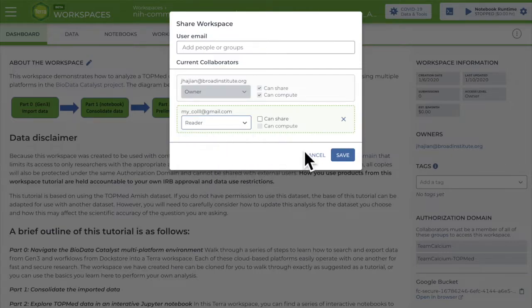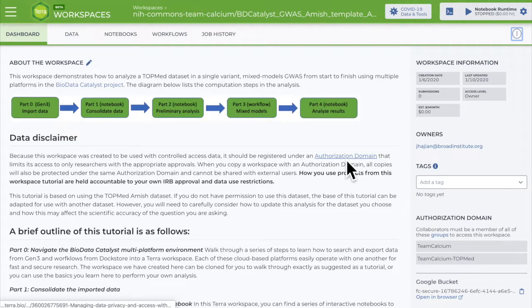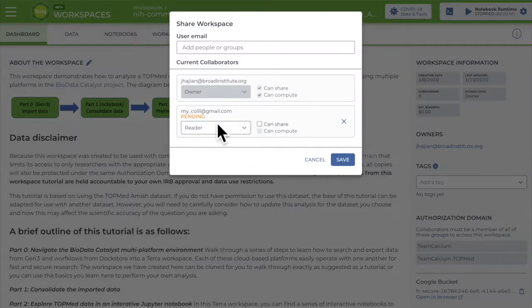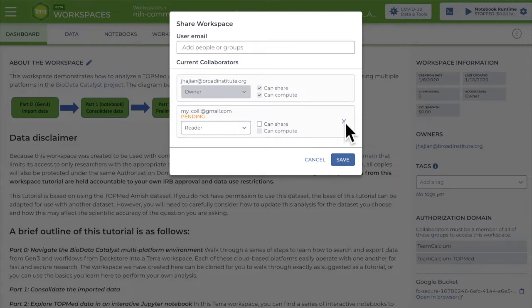When you click Save, everyone you've added will get an automated notification you've shared the workspace. It happens almost instantaneously, and you can check the status by selecting Share again. If there's a pending warning with one of your collaborators, this usually means there's a problem with the user ID typed in. I find it's often a typo, or it could be you've tried to share with someone who's not registered on Terra. You can cancel that share and add the person again to correct the mistake.